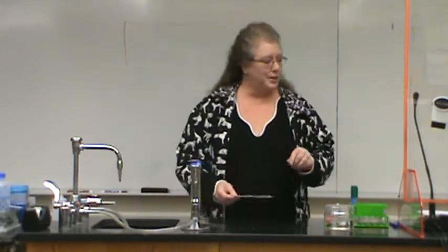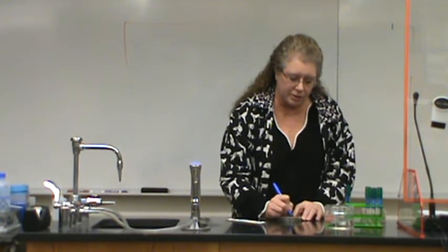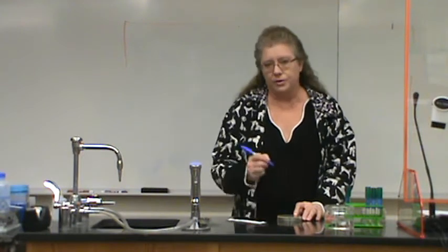Okay, so back to our Kirby Bauer method. So we need a Mueller-Hinton plate, and let's say we're going to do the first one that is Staph aureus. Remember, you always label the plates on the bottom. You're going to put the bacteria that you're putting on the plate, very important. And your initials or something like that, date, designation, whatever you want to put on there. But most importantly, you need to know what's on the plate. So there's Staph aureus going on this plate.